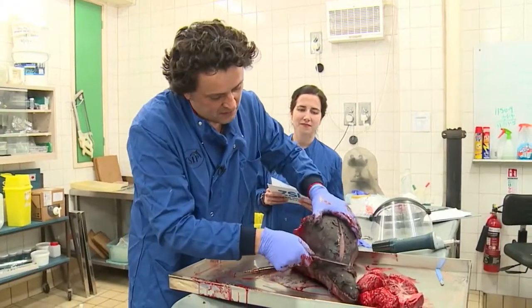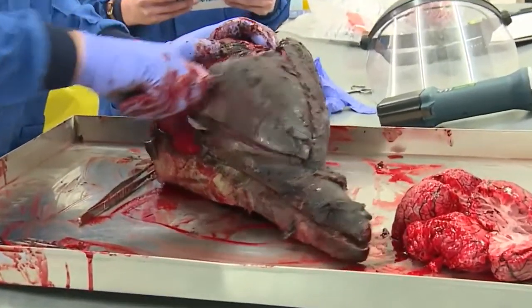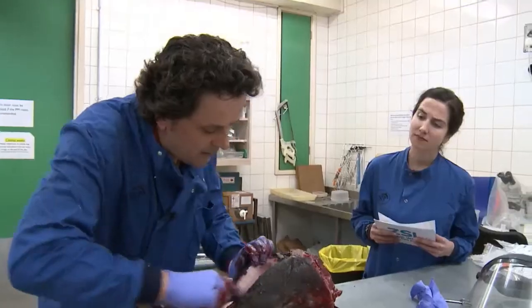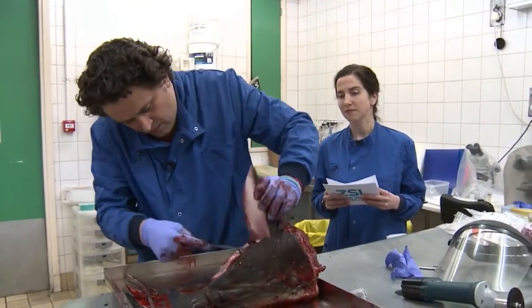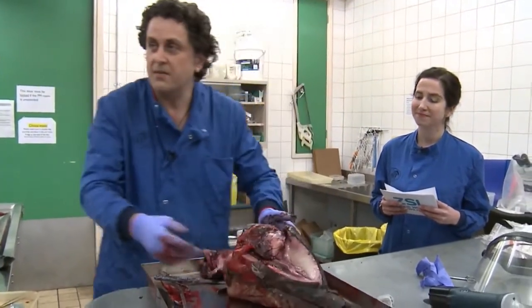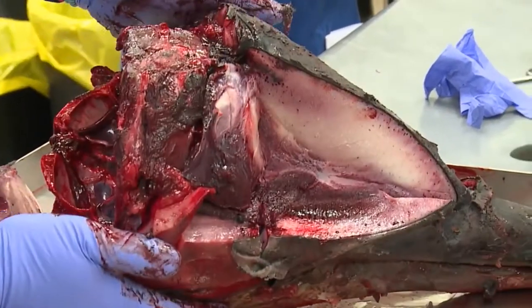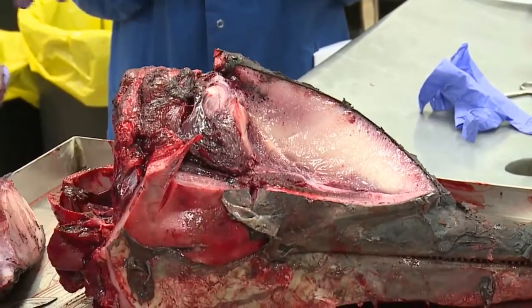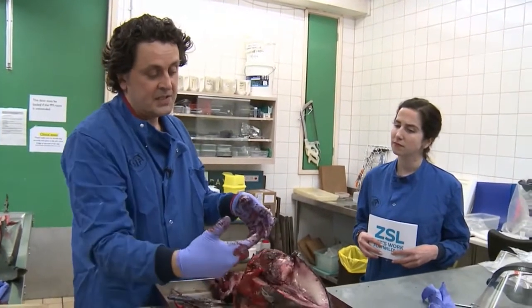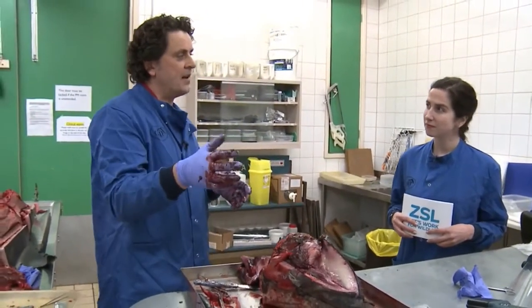If we just take a section out of the melon. I'm just taking a quick cross section through that. So on this camera here, we can see the melon's basically a big ball of fat with these red muscular attachments underneath there. The muscles contract and relax, and they change physically the shape of that ball of fat. And that actually modulates the sound wave going through the melon, so it changes its pitch and its frequency out to the target fish. And it's like the idea of the Second World War submarine.